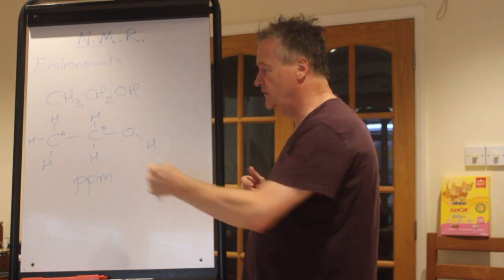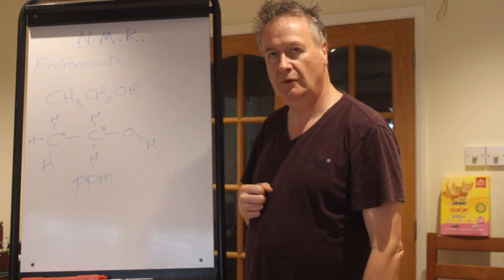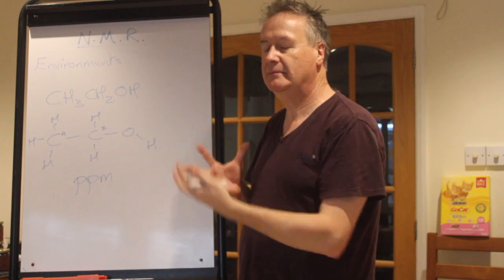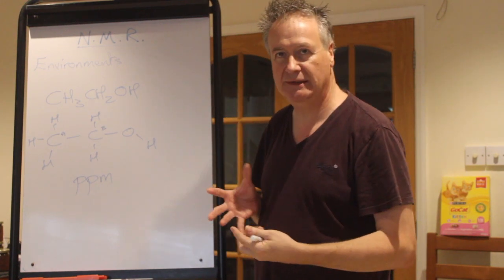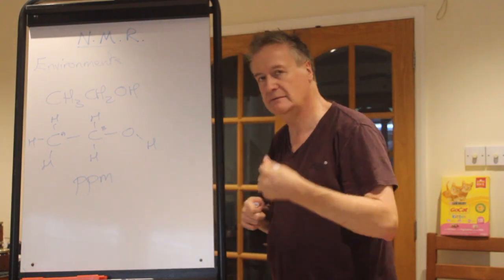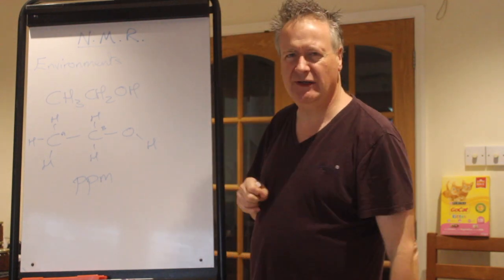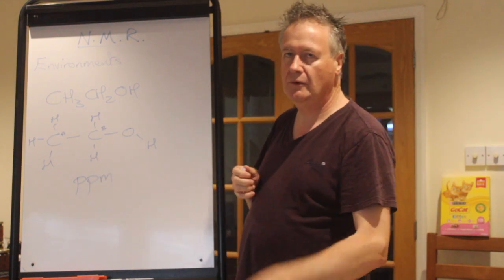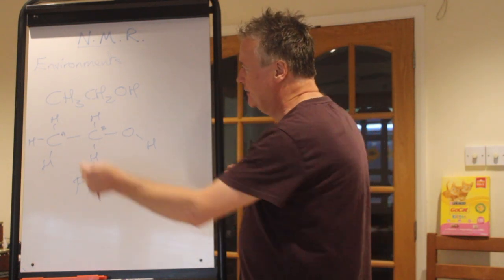It is just because the difference between the frequencies are quite small, and so you do it as a parts per million to make the number larger and actually have a handleable number that isn't 3.2 times 10 to the minus 15 or something like that. You want a really small. That's too small, but you don't want a tiny thing. So you do it in parts per million to make it a more recognisable number and a more manageable number to work with. So it's about environments.